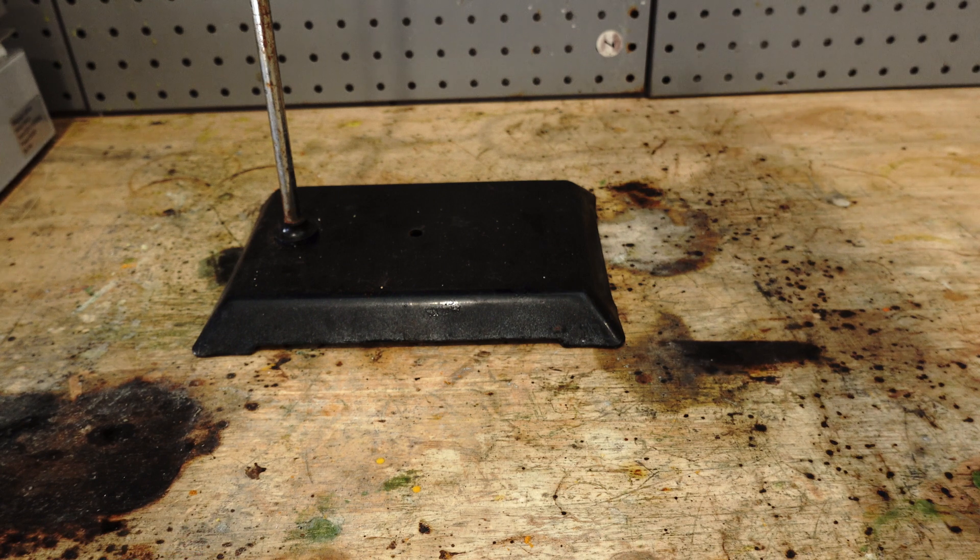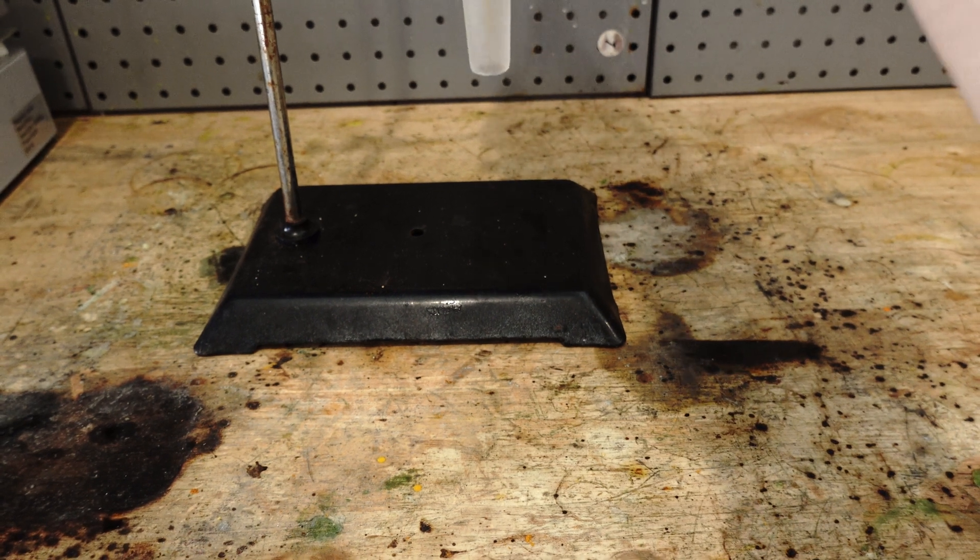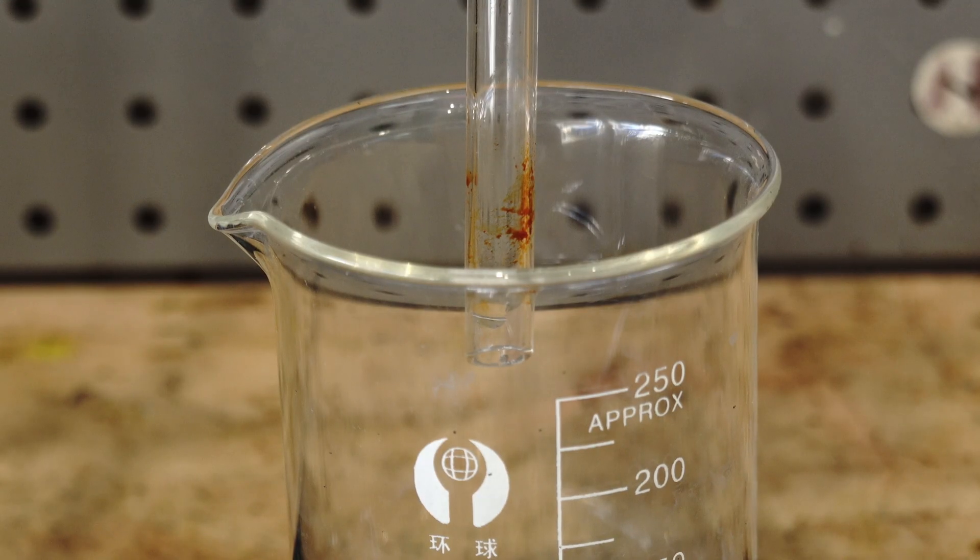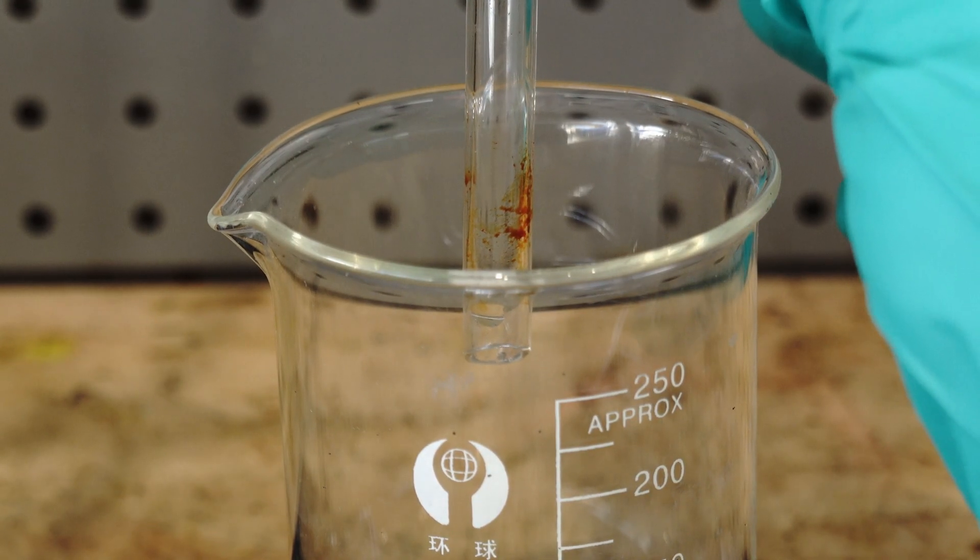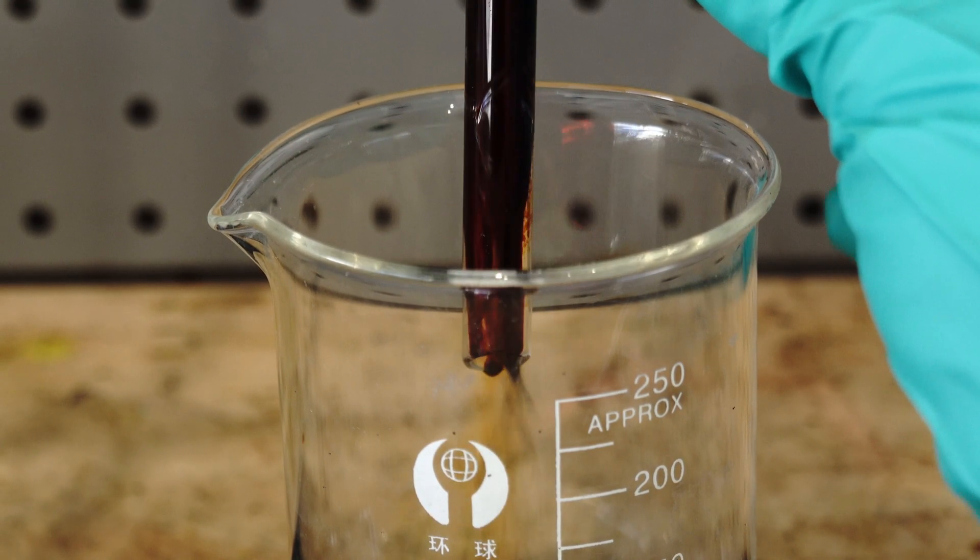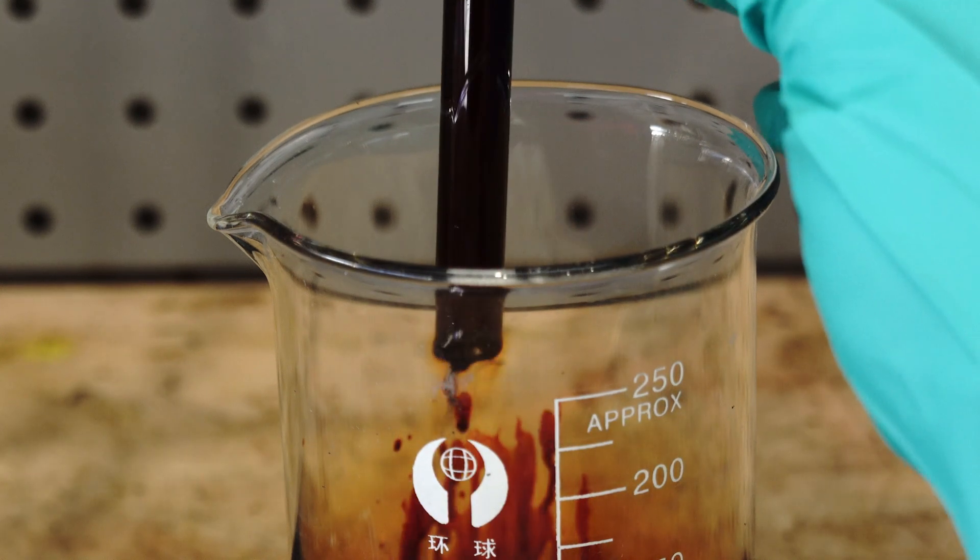We then let this mixture sit for about 10 minutes and separate into two separate layers. Since Bromine is two times as dense as sulphuric acid, we drain the bottom layer into a separate beaker. This is our Bromine.